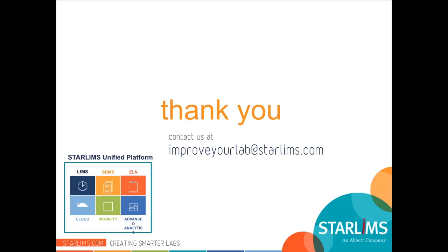As you can see, I'm running out of time here, so I'll make it short. This is a very exciting time to be in the laboratory informatics space. What I discussed today are just two key emerging trends, mobility and big data analysis.